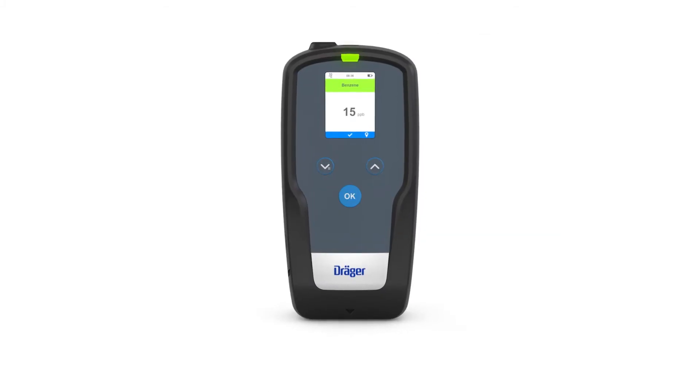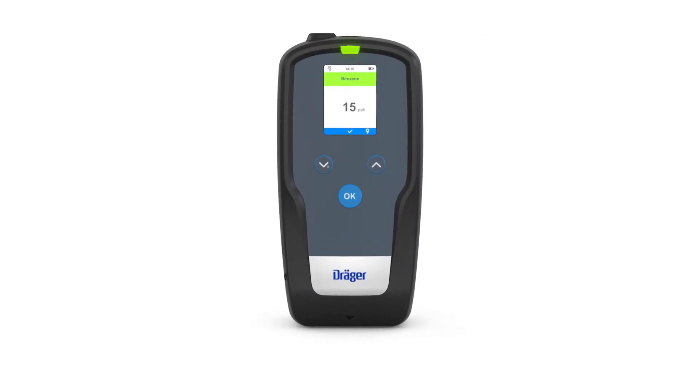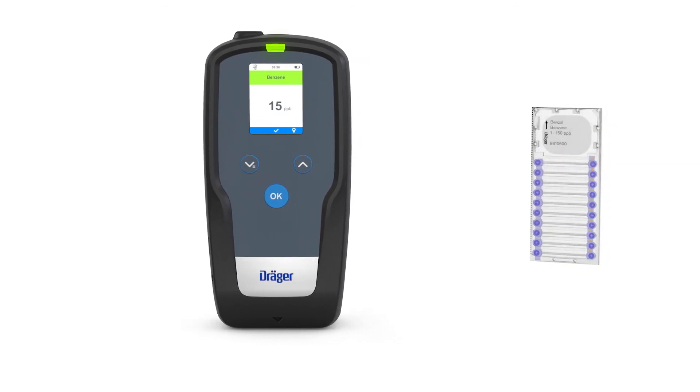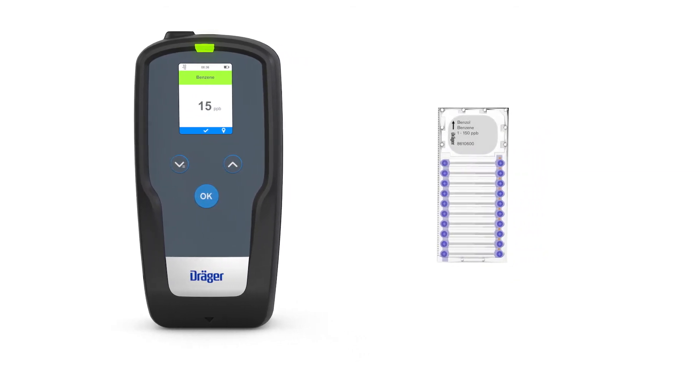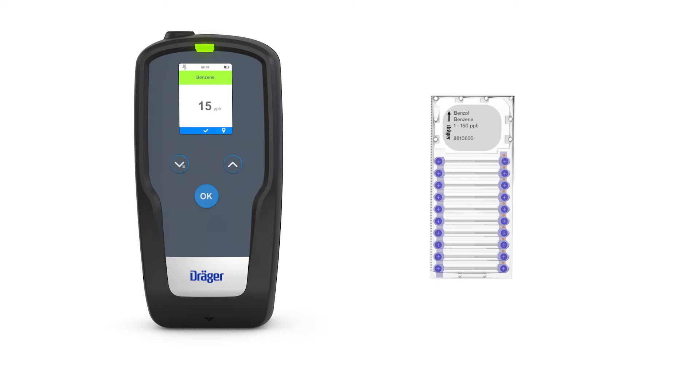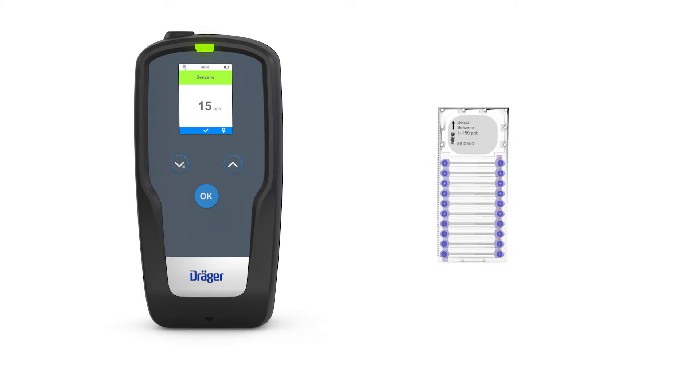The system consists of the EXACT 7000 analysis device and a range of microtubes for various gases and vapors. A single microtube can be used to perform 10 tests in a row. The system is continually being expanded to include testing for even more types of gases.